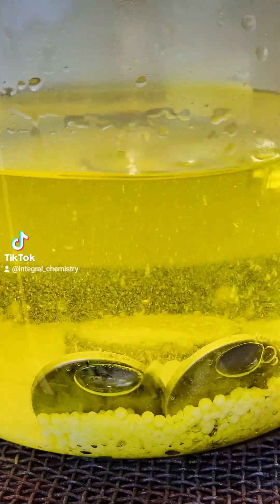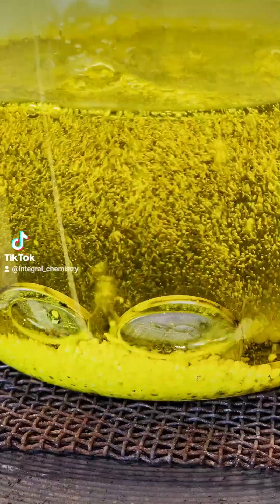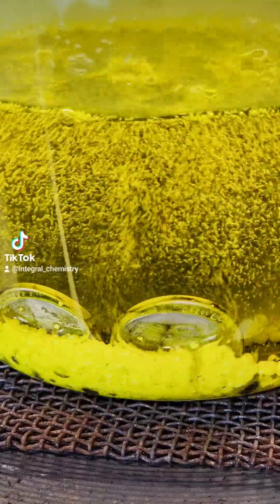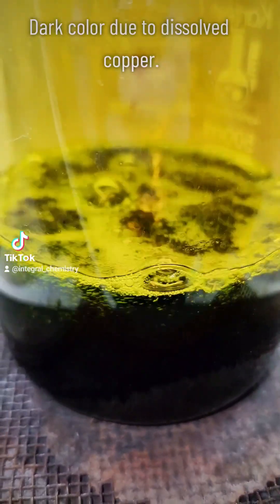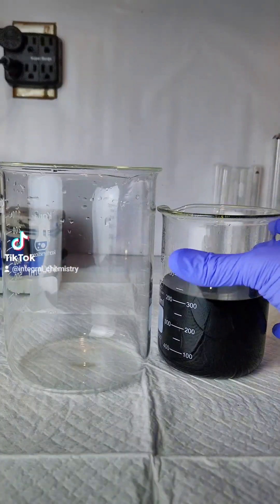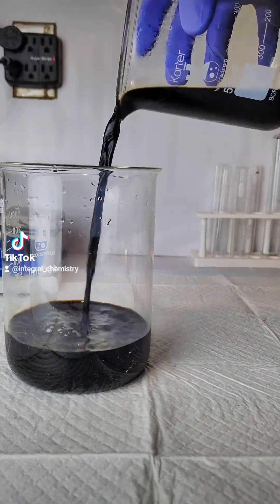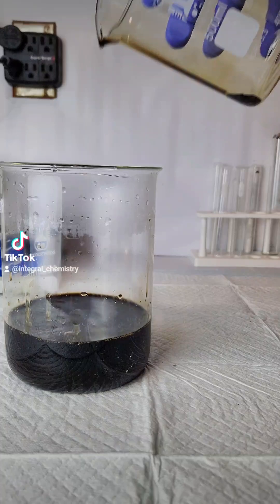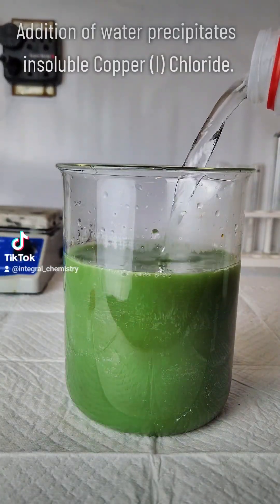This acid solution is boiled for several hours until no nickel metal is visible, at which point the solution will become very dark. This dark color is due to dissolved copper chloride, and once I get to this point I pour my solution off into a larger beaker and add a good deal of water. The addition of water will precipitate the insoluble copper chloride as a white solid, and this will settle to the bottom over time.